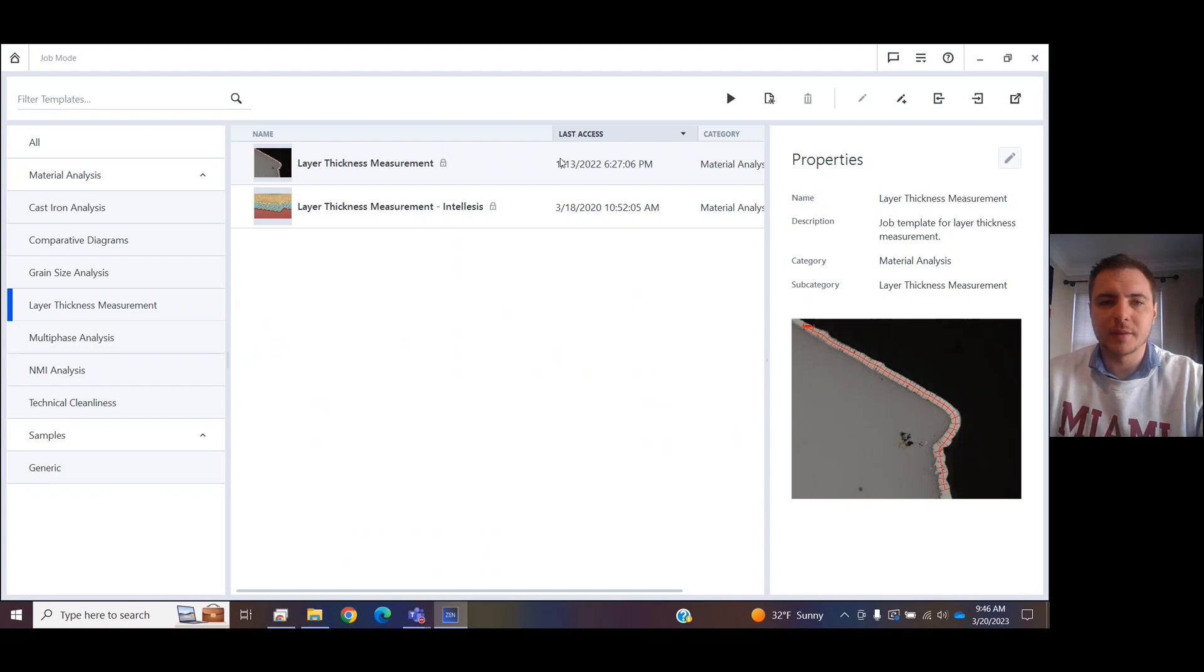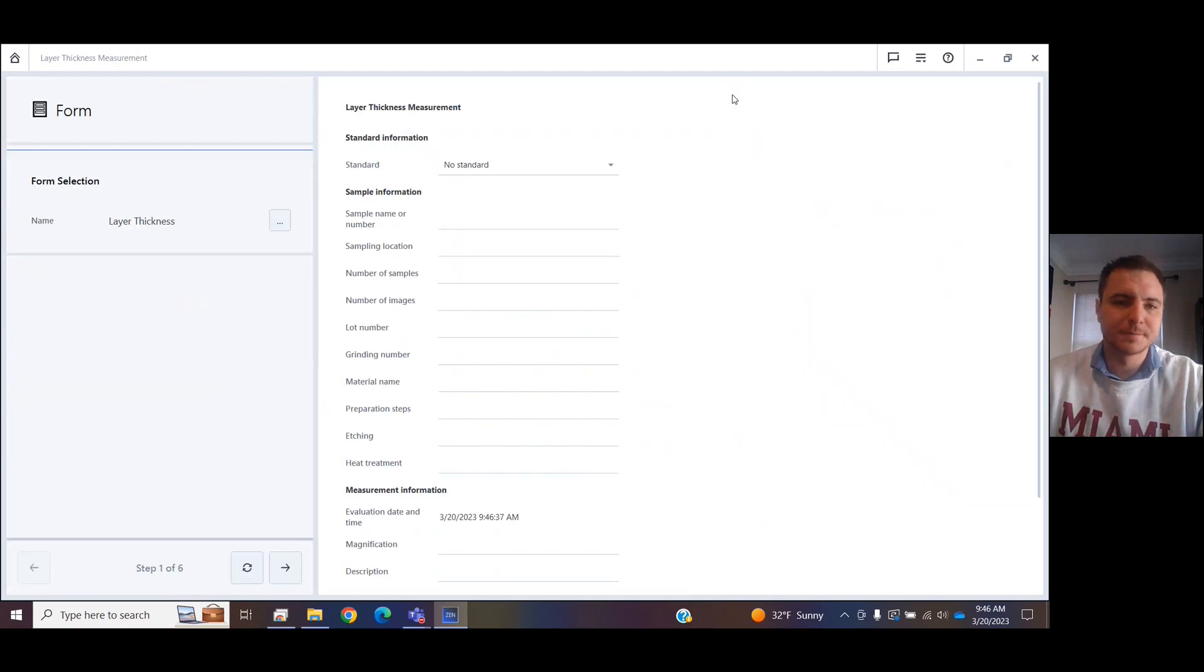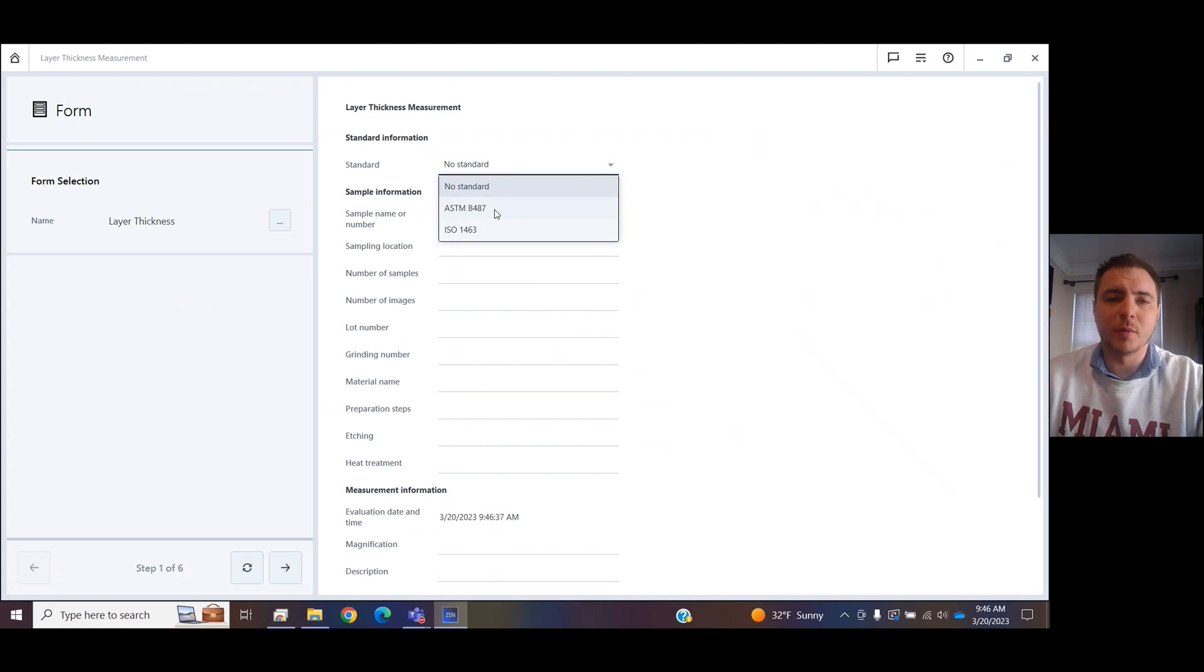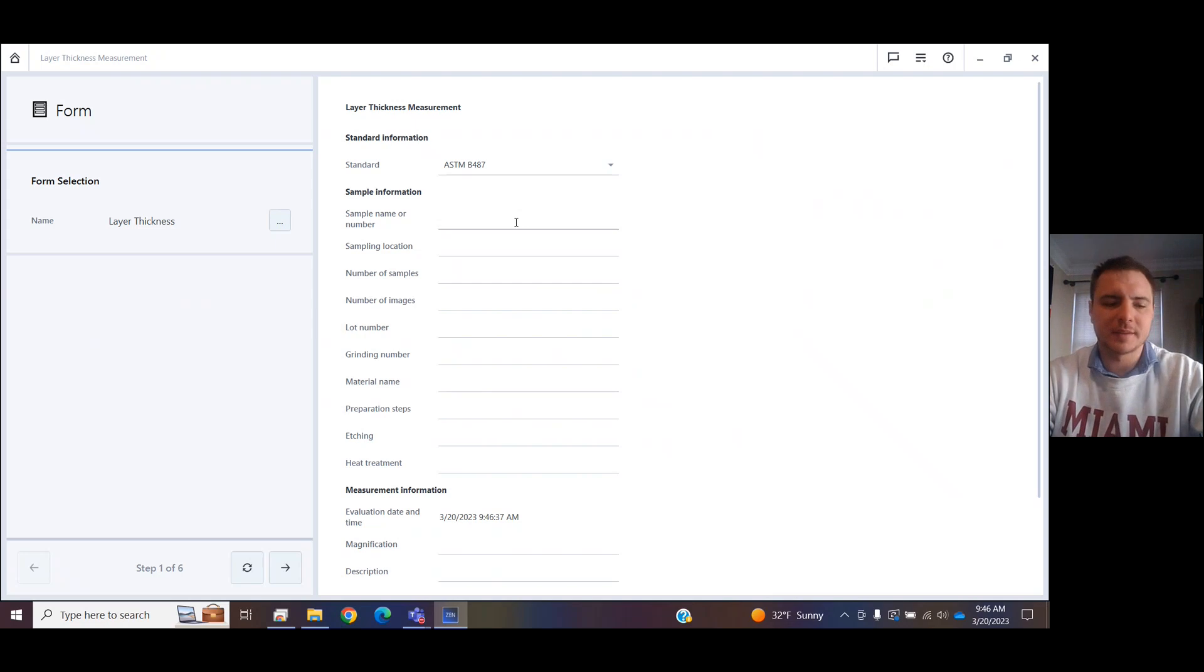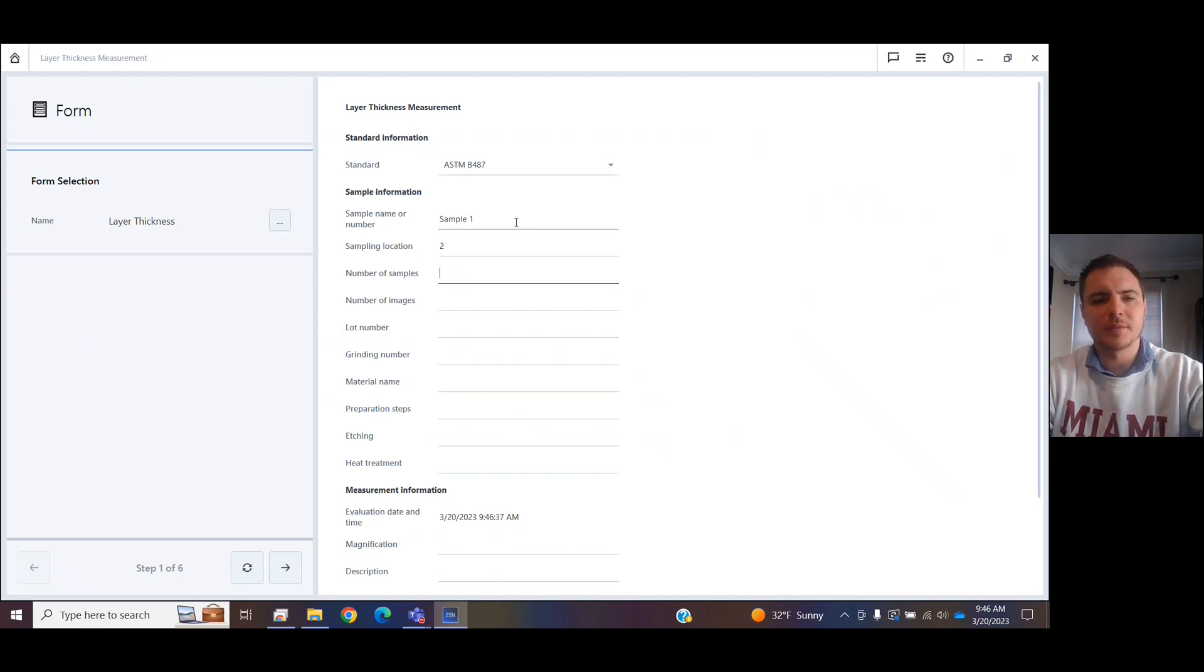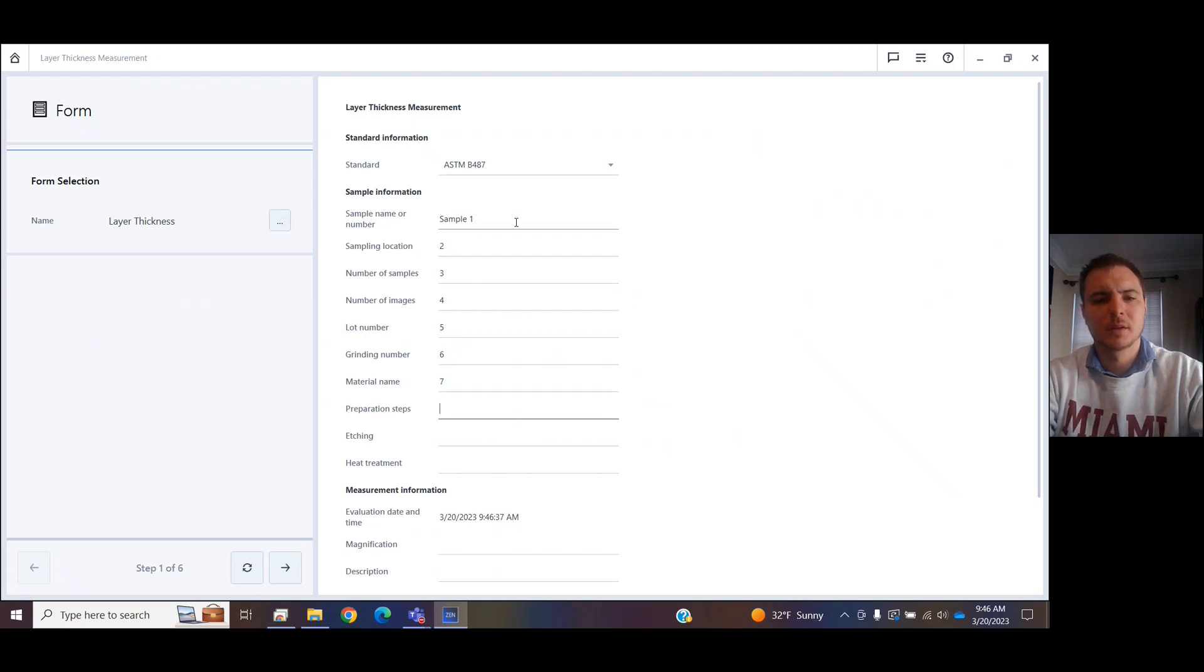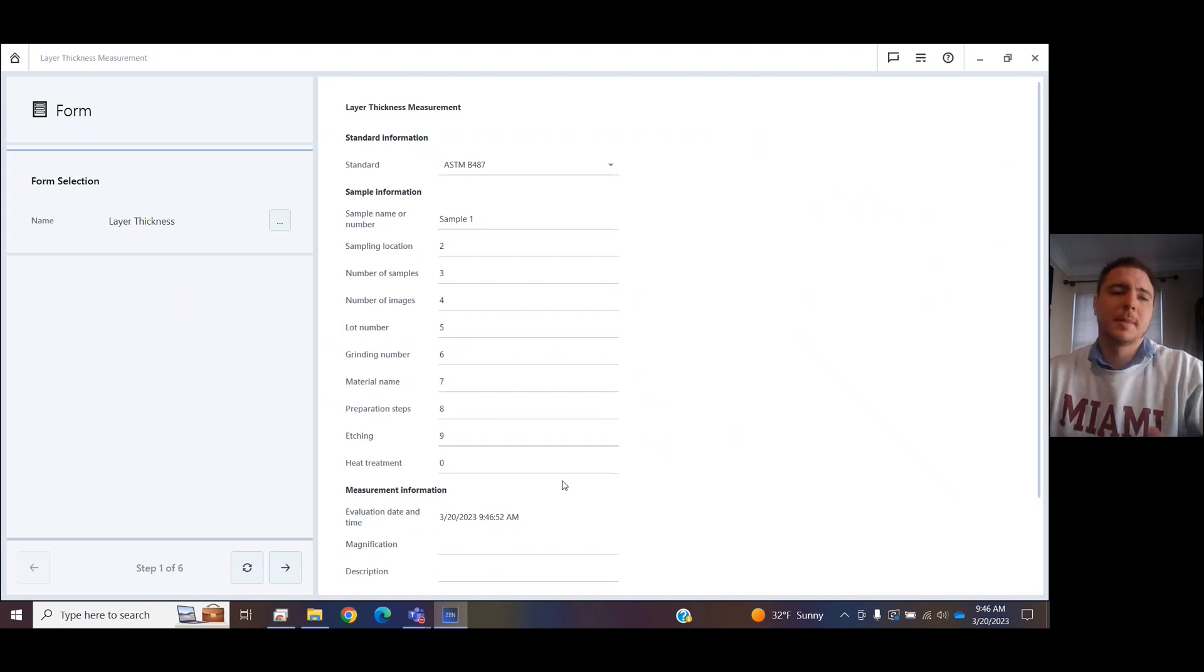We will select Layer Thickness Measurement and we will run it. Right here, you can enter information for the form, the report at the end of this process. Maybe I type in sample one, and I'm just going to fill these out arbitrarily. So we get the point.